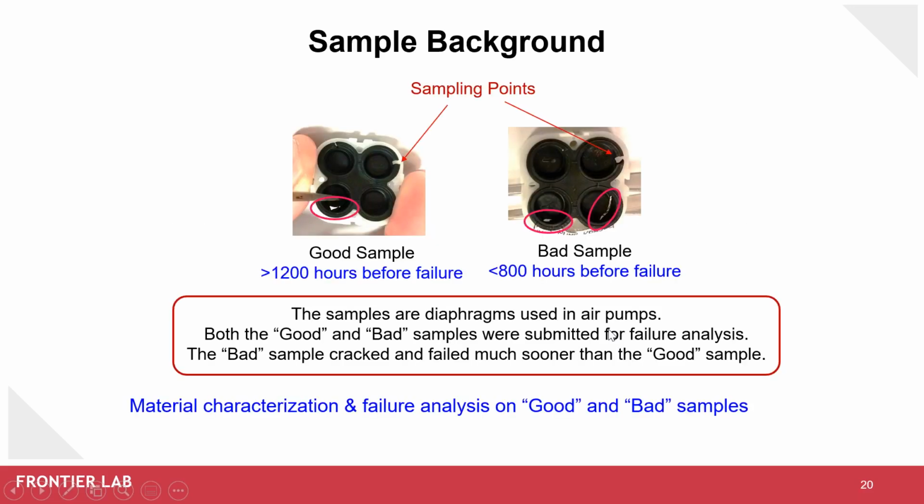All right. So polymeric products are often complex and frequently, as we know, include components from several sources and suppliers. The formulation details of the polymer parts are often not known to a lot of manufacturers. Actually, companies in the later stages of the supply chain may have even less information on components in a final formulation.